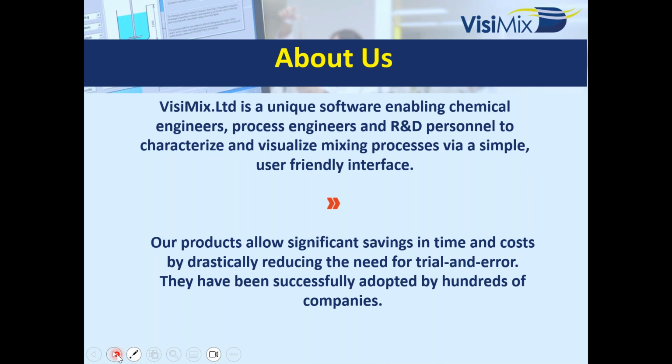With the velocity, we're able to calculate different kinds of parameters. The first group of parameters will be hydrodynamic parameters, mixing parameters that are basic parameters like power per volume, energy of dissipation, or power per volume distribution, mixing times at different levels, macro mixing time, micro mixing time, shear rate, eddy size, all the parameters that are characterizing the flow.